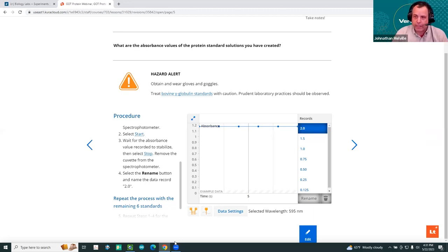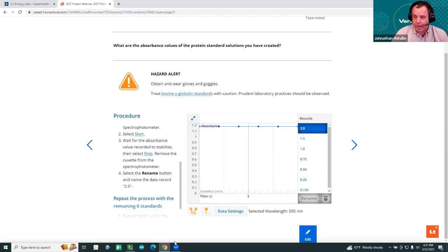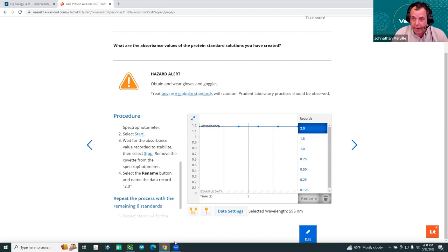After collecting data, the next step would be to rename each run to reflect its concentration — so this one would be labeled '2.0.' You'd do this for a whole series of samples. Rather than doing every sample live through the whole webinar, I'm going to switch to sample data. Also important to note: live data collection in LT only works on PCs — Windows only. You can view sample data on other platforms.